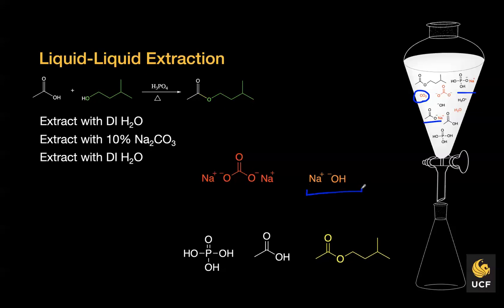Typically we could use sodium hydroxide. It's a lot easier to deal with sodium hydroxide than sodium carbonate, mainly because in the presence of sodium hydroxide, we won't have to deal with carbon dioxide gas evolving. But what we have right here is a very strong nucleophile. And anytime you're dealing with aldehydes, ketones, or esters, those are susceptible to nucleophilic attack.